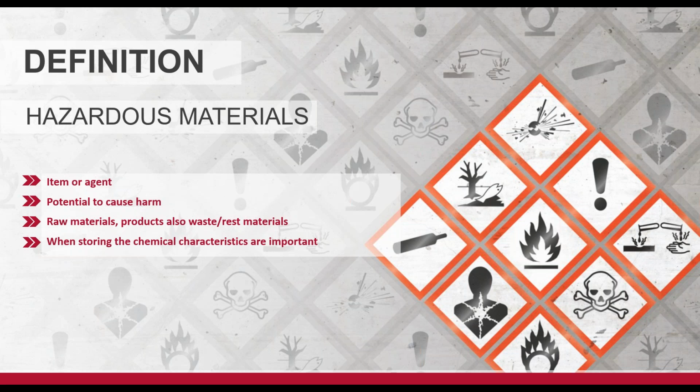And then how long do they store it? What do they do with it when they store it? Do they mix it together, etc.? All of that is extremely, extremely important in that whole hazardous material process.